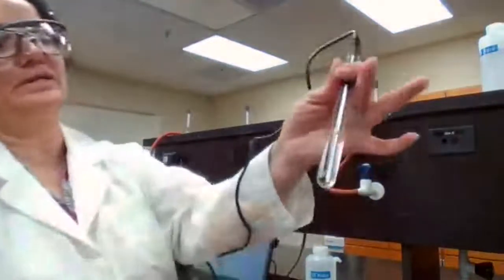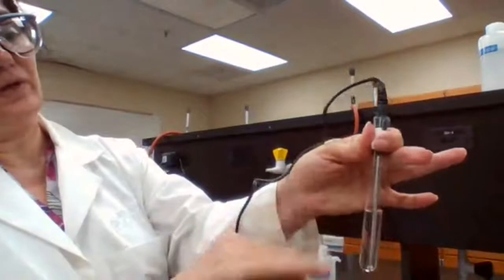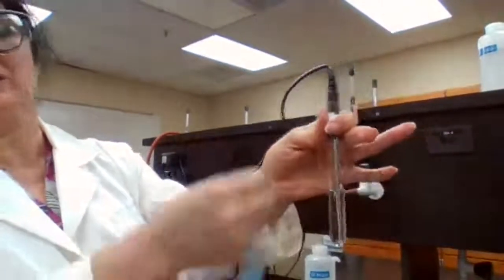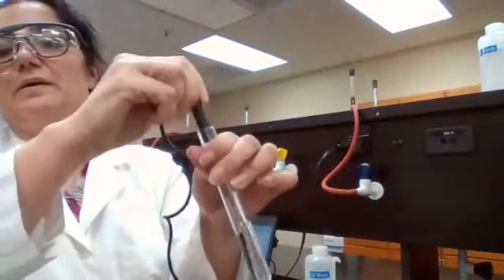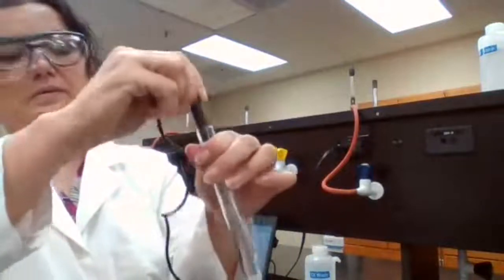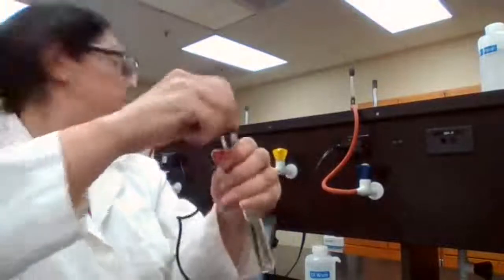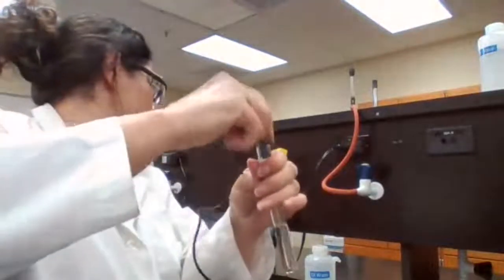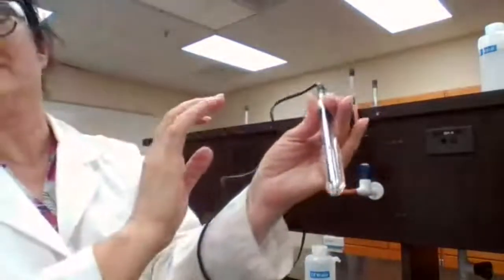It didn't crystallize. It's in the solution. So we are looking for the temperature that crystals are forming to record. Right now it's 72, 72.6, and no crystals yet.